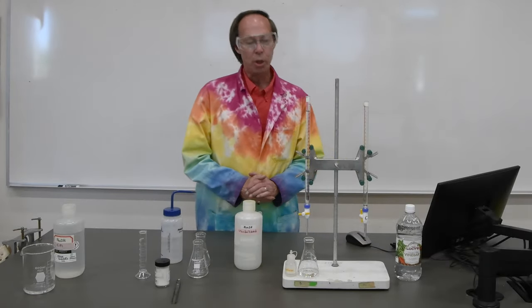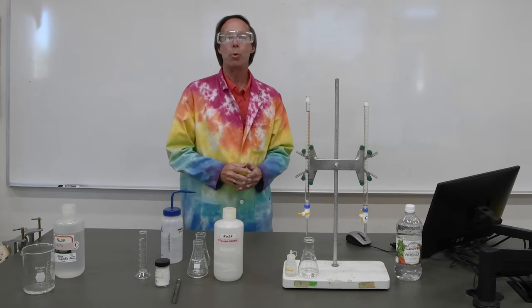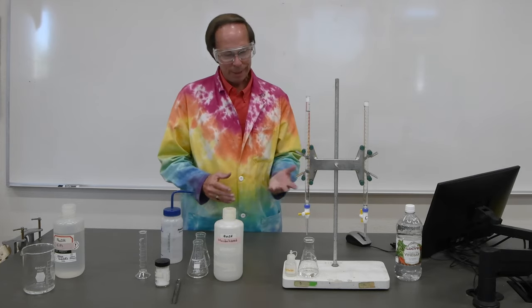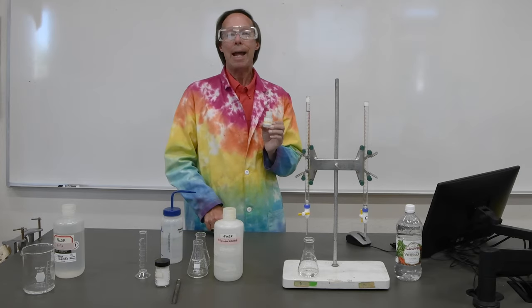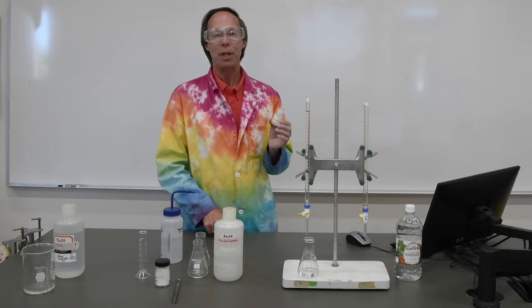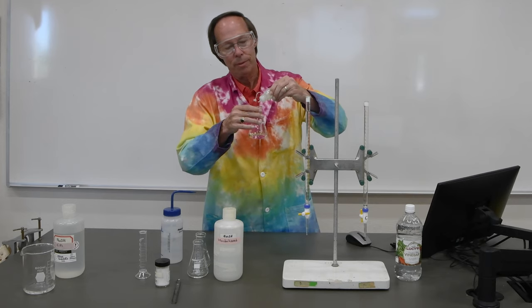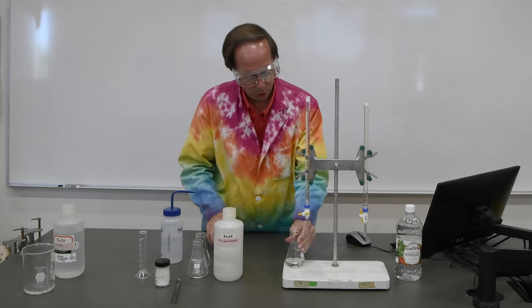All right, we're just about ready to go with our titration now. The only thing we're missing is an indicator. You may remember when we did the water hardness lab, we used Eriochrome Black T, which was an indicator that was sensitive to calcium. Today we're going to use an indicator called phenolphthalein. You may have heard of this before. It's a common acid-base indicator. It's colorless when the solution is acidic, and it becomes pink when the solution is basic. So we're going to add two or three drops of phenolphthalein to our KHP solution here. And as expected, there's no color.